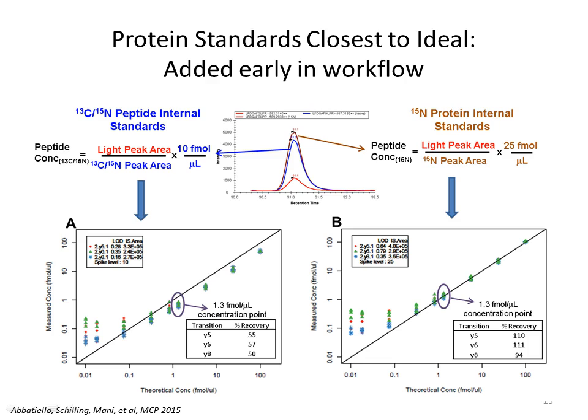And in Skyline, you can normalize by one internal standard or another internal standard. When you take the C13N15 peptide and normalize that response to the synthetic tryptic peptide, and plot its response on a log scale so we can see it clearly, you see that it's falling below the theoretical line and plateauing at the bottom.